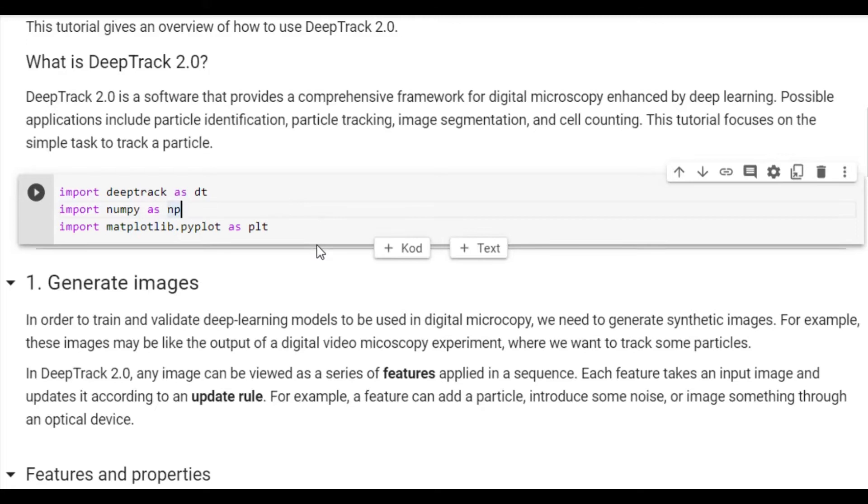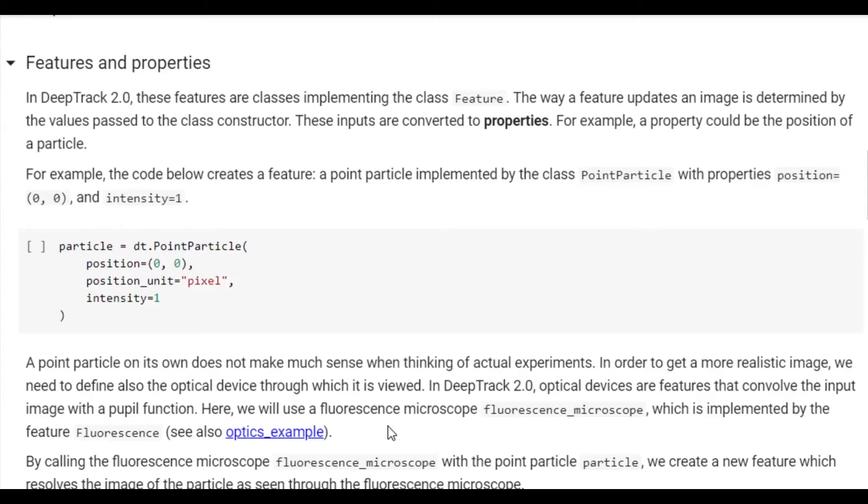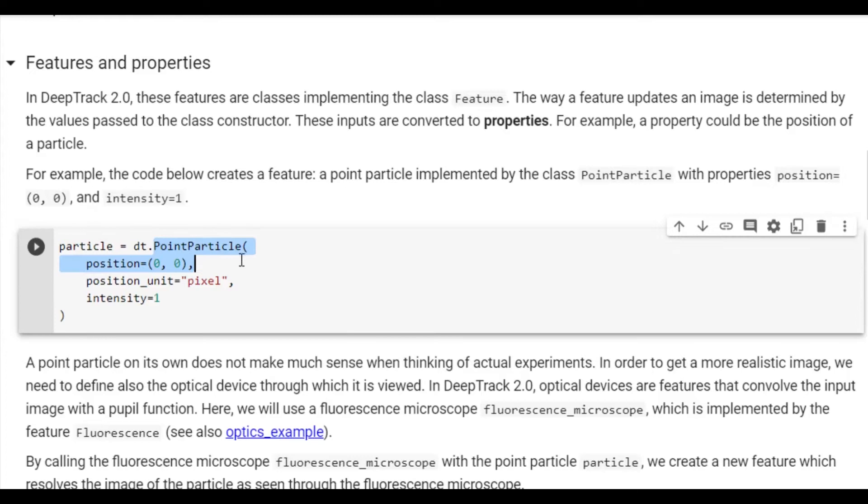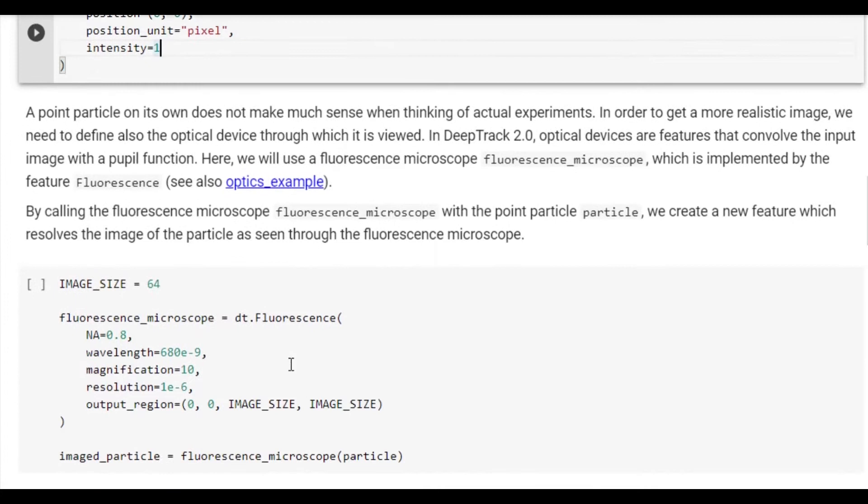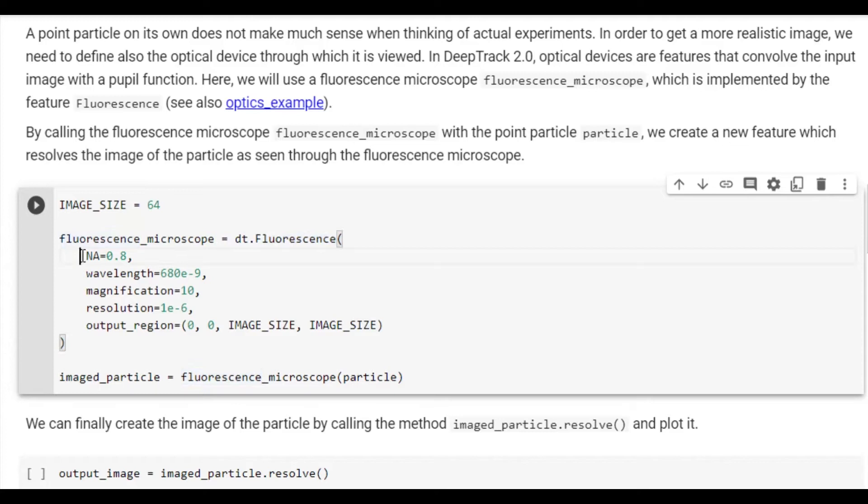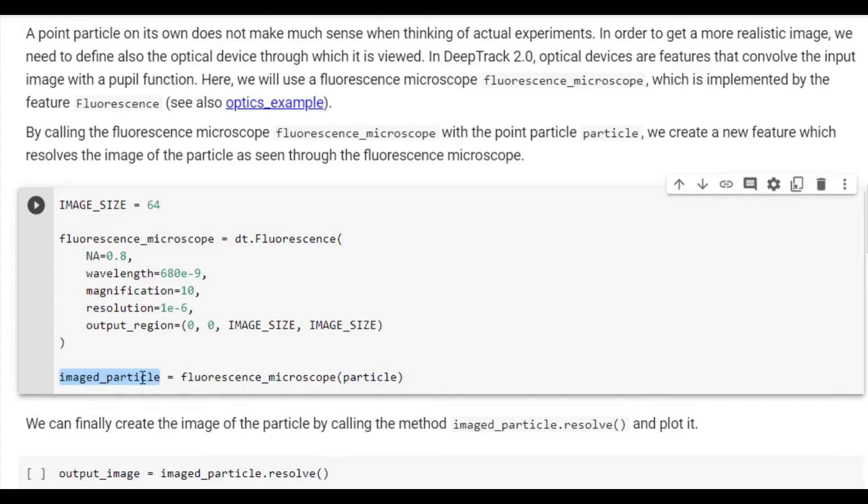Now we can begin the process of defining the data generation pipeline. We'll start by defining a particle. We will use a point particle, which is the simplest example of a particle. We'll give it a position of 0, 0 in units of pixels, and an intensity of 1. To actually see the particle, we will have to image it through a microscope. As such, we define an image size as well as a fluorescence microscope. We also define the optical parameters of that microscope as well as the output size. We tell the microscope that we have just created to image the particle by calling it with the particle as the first parameter. Note that this creates an object which in turn creates images. It is not yet an image.